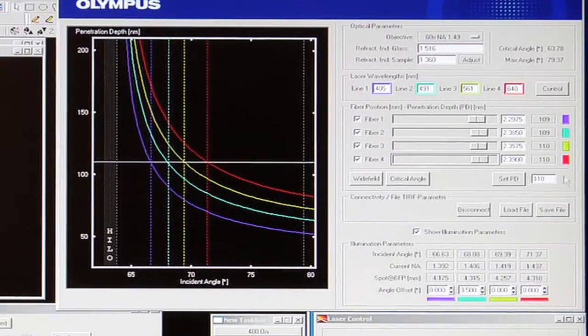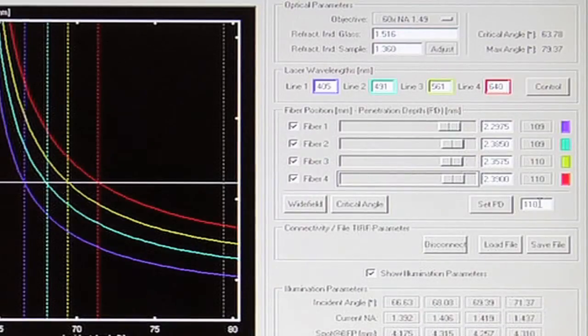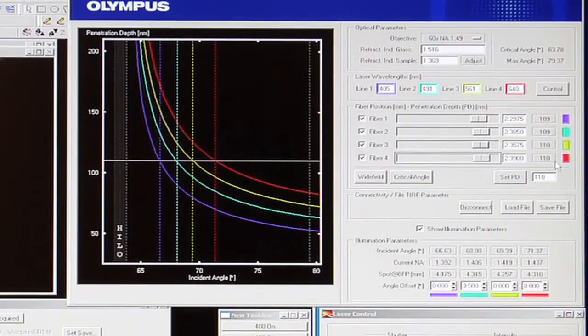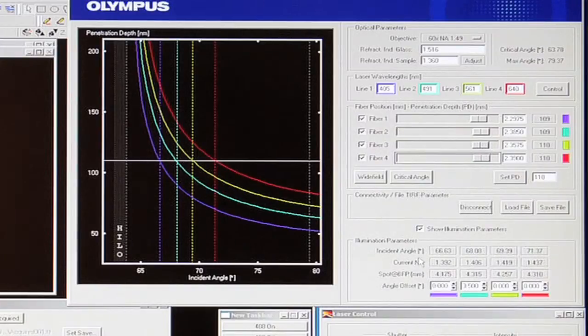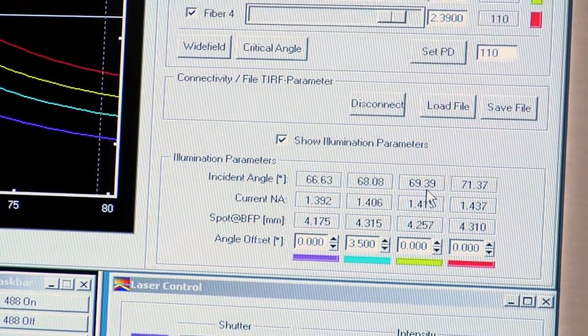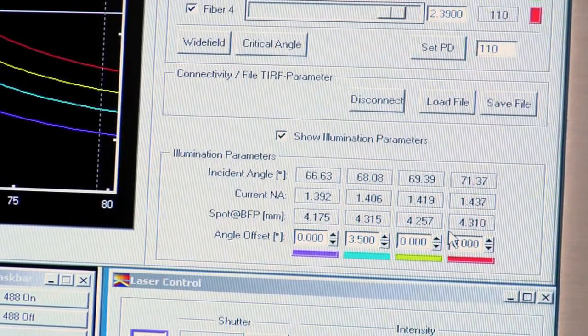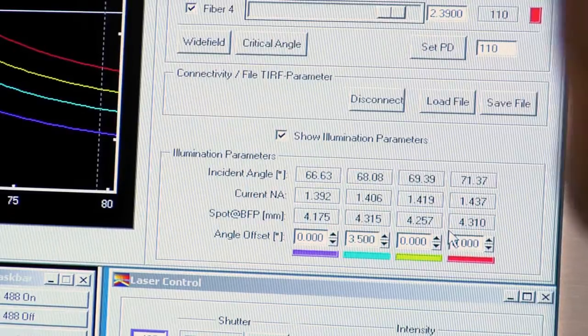Something that is nice is we're able to go in here and select a predetermined calculated penetration depth based on the parameters that are set up. So right now it's set at 110 nanometers. Just by clicking set penetration depth calculates or sets up such that each wavelength is at the appropriate incident angle, which is read down here. You can see 66.6, 68, 69.39 and 71.4. So this really demonstrates the need to be able to have individual control.